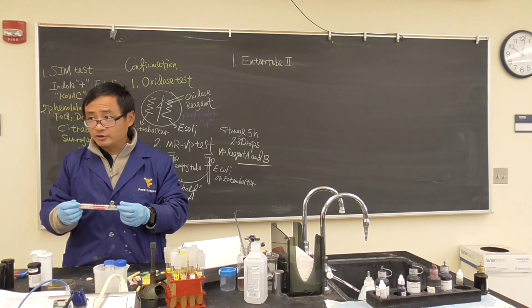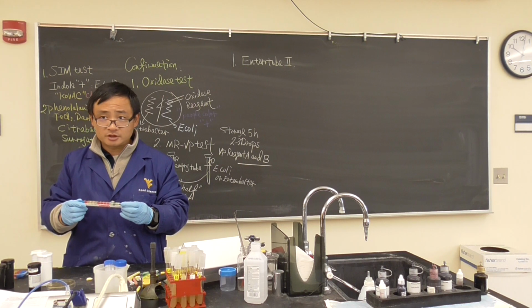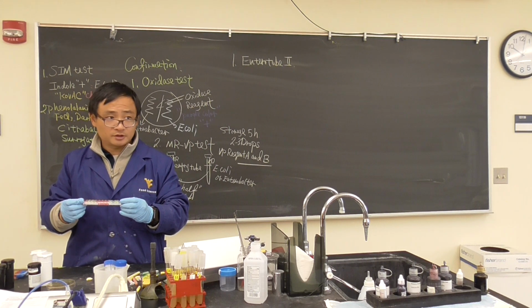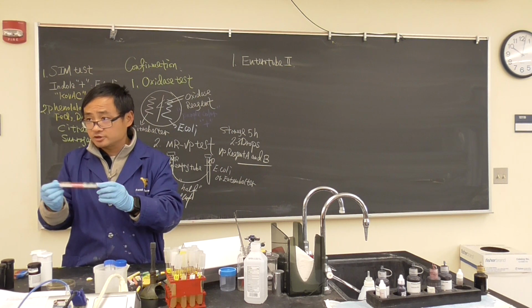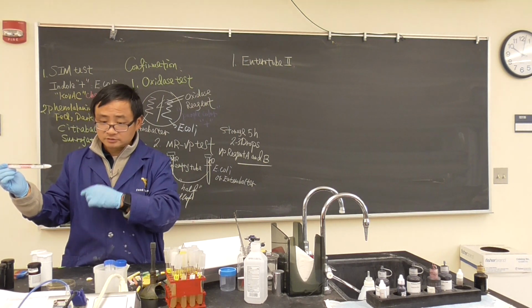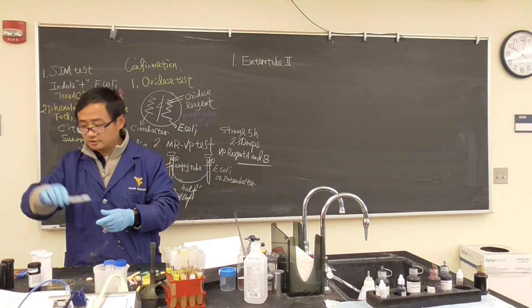If you want to keep it for a longer time, you have to freeze it. Put it in a bag, freeze it. You will keep it for the rest of your life. If you don't like it, just put it on the bench top for a couple of days. It will start to shrink because the solution will be dehydrated. If you want to keep it longer, put it in a freezer. Okay? Very good. That's a good try for you.